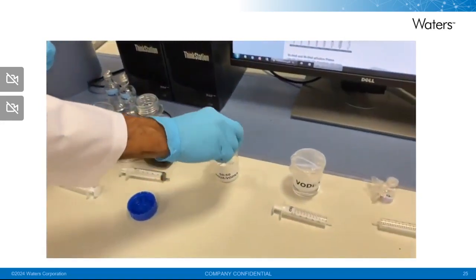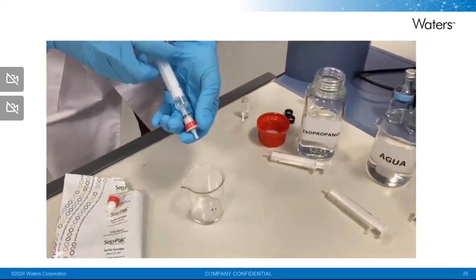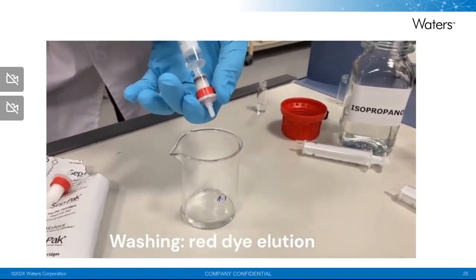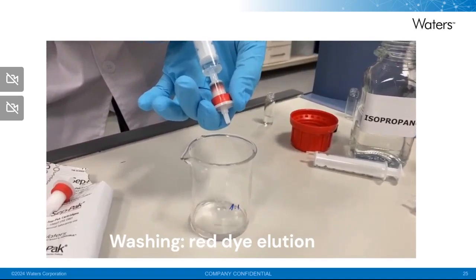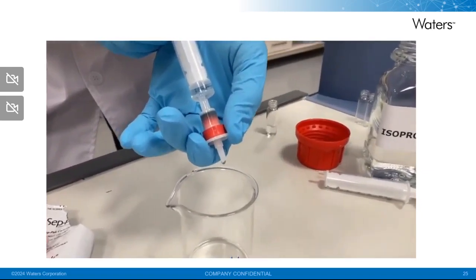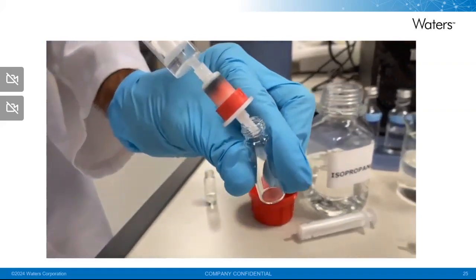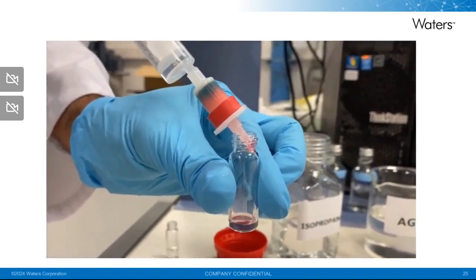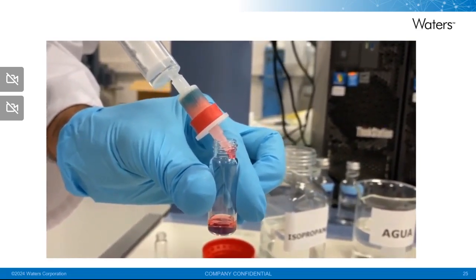The next step is the washing step, and we're going to be using a 20% ethanol in water solvent. And here we're going to see how we can get rid of some interferences. In this case, let's imagine that the interferences are the red dye, and we see that with this 20% organic solution, the red begins to flow through the cartridge, while the blue dye still stays on top of the cartridge. So we can selectively elute the interferences, in this case the red dye, from the cartridge without eluting the analyte, which is in fact in this particular example the blue dye.